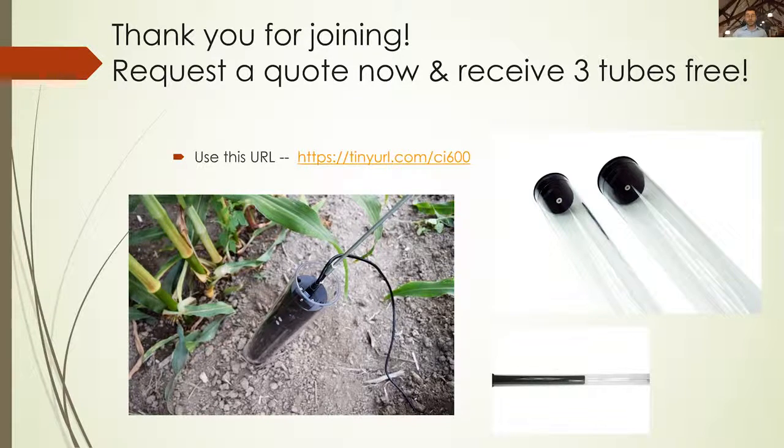The next question is, will the tube influence root growth? Acrylic tubes have been long studied, and how it's installed is the biggest factor affecting root growth. Making sure that the environment and the soil around it are very similar to how the roots were growing on the rest of the plant is very important. That means making sure the soil is not compacted, that it has a similar moisture rate, that you're not leaving large holes in it, and that UV light is not getting in the tube. The insulation caps help with the UV light, though I definitely suggest that if large parts of the tube stick out of the ground, you make sure those are wrapped up. Some examples have been PVC, duct tape, really, or even white paint, just some way to keep UV light from getting down into the ground and inhibiting root growth.